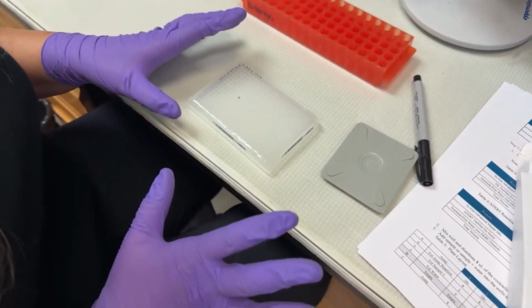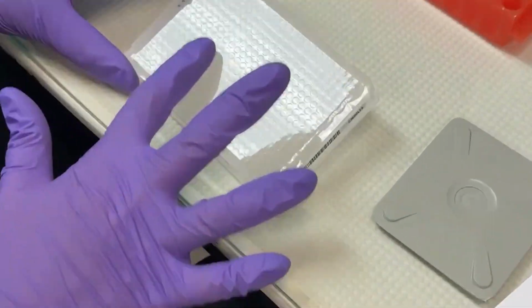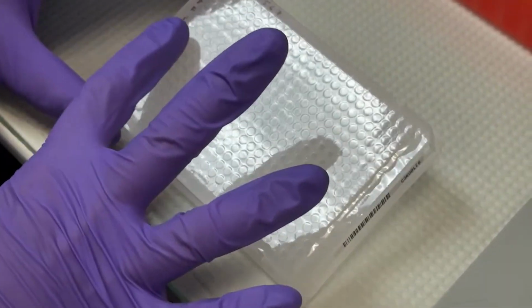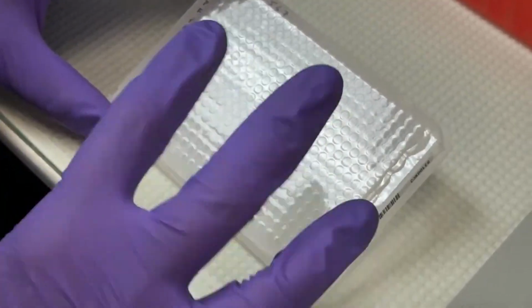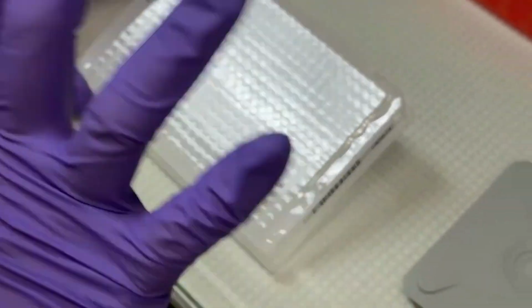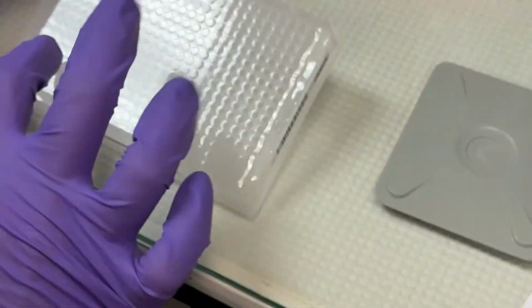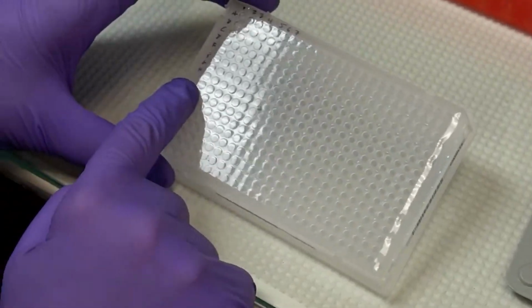You're going to have a really hard time seeing this on camera, but often what you can see is if there's an incomplete seal, you'll actually see a difference in color. The reflection is different. So if it's not stuck, it'll actually look like a white spot rather than a nice dark circle.